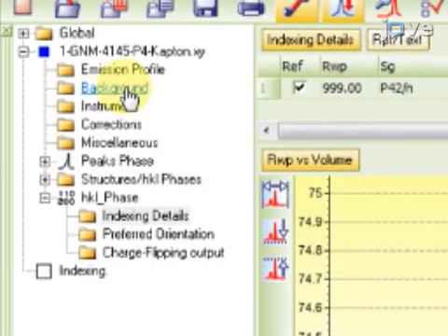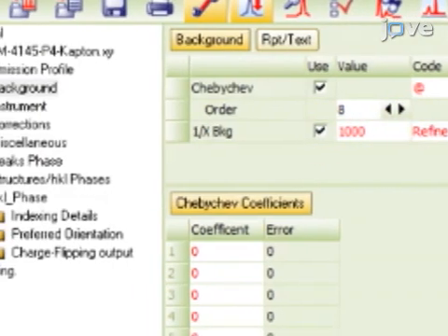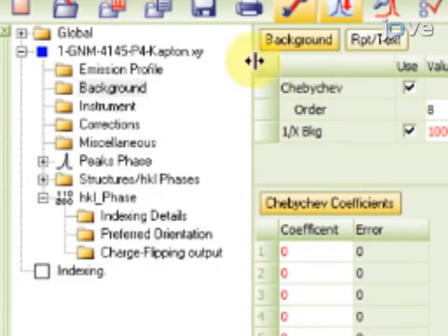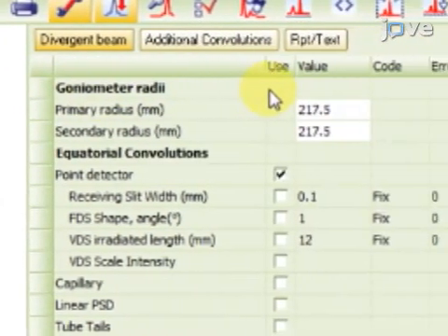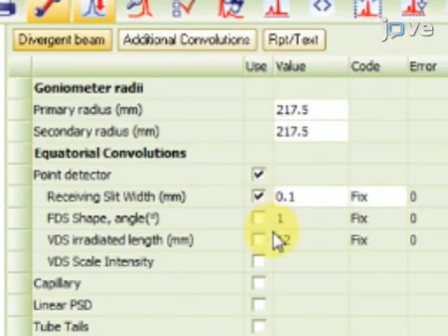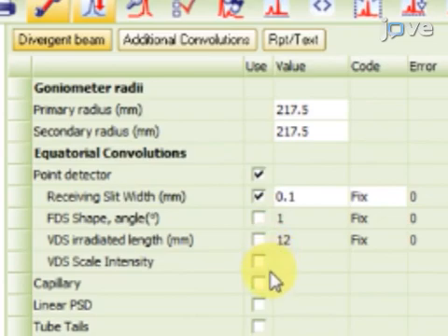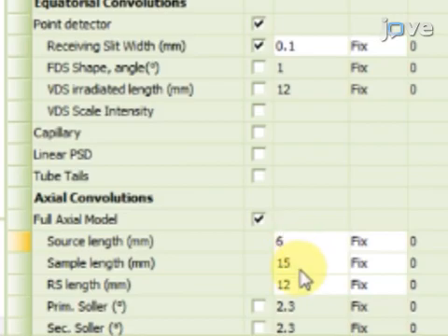Under Background, change Order to 8, and then select 1 over background term. Next, click Instrument. After setting the primary and secondary radii to 217.5 millimeters, select Receiving Slit Width under Point Detector. Under Full Axial Model, set the Source, Sample, and RS length to 6 millimeters.